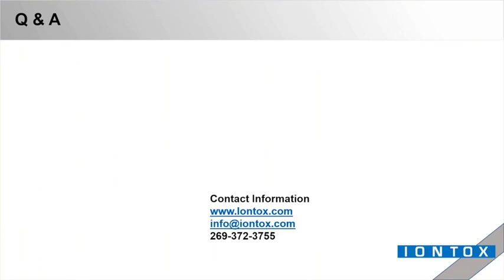Okay. Jamin, there's a question. They want to know if we've ever used spheroids in the plate, and if so, what were the results, or can you just speculate on how they might work? So the answer is not yet. That is something that we're definitely getting into. There are a number of potential benefits to using spheroids.